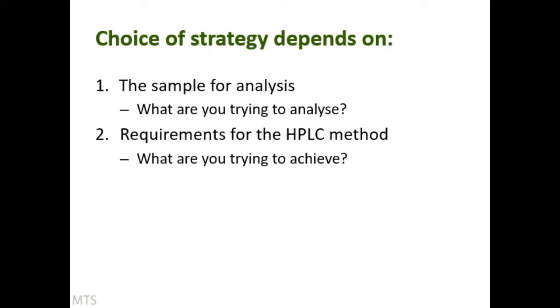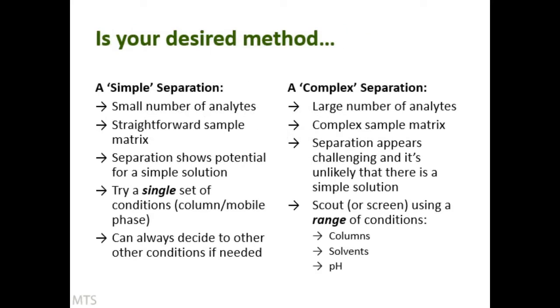And what I usually advise in courses is that you try and split your method up into maybe two very vague categories. You can go much further with this, just trying to give you a starting point idea. I've talked about a simple and a complex separation, and I've put them in quotes because it's quite hard to say there is any such thing, but that's what we're aiming for. It's just broadly, when you review the method at the beginning, you can make some deductions.